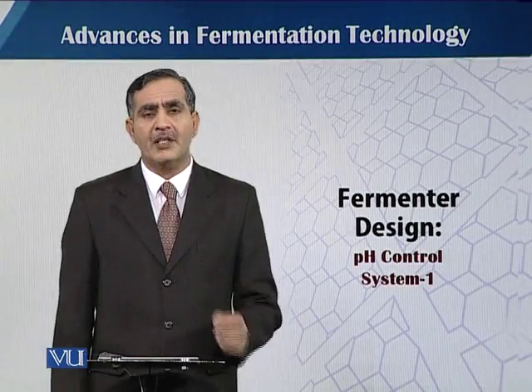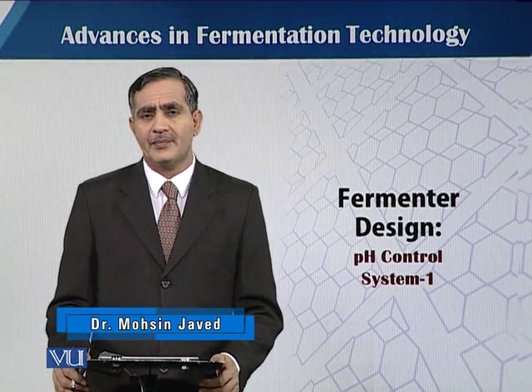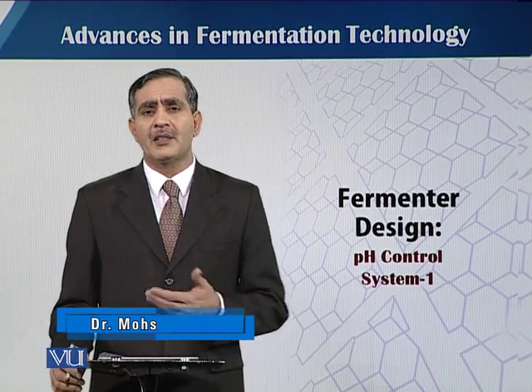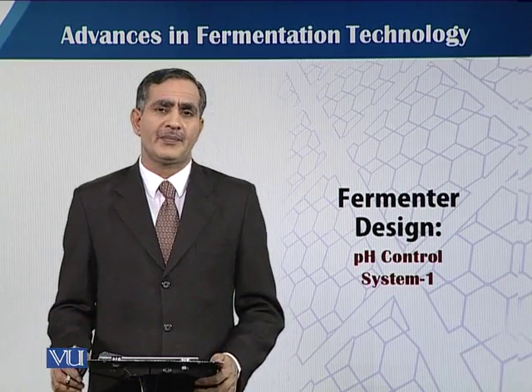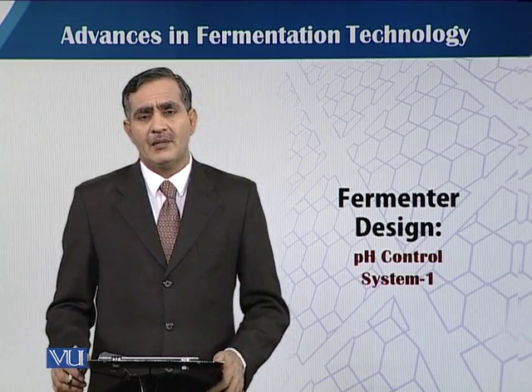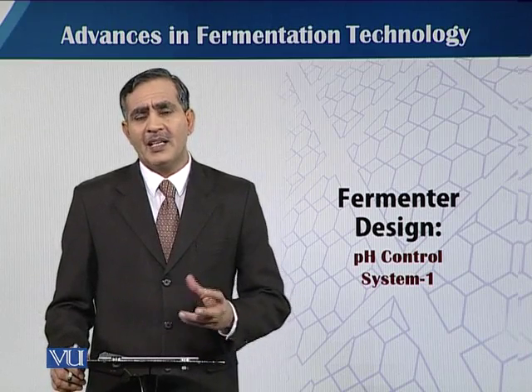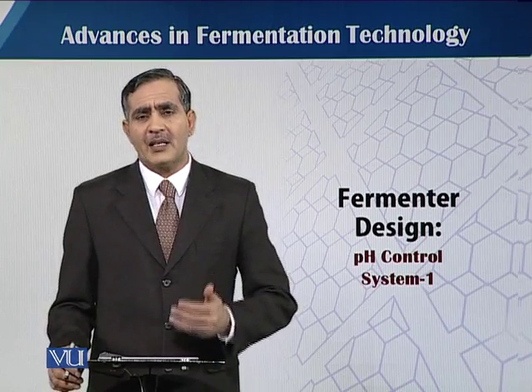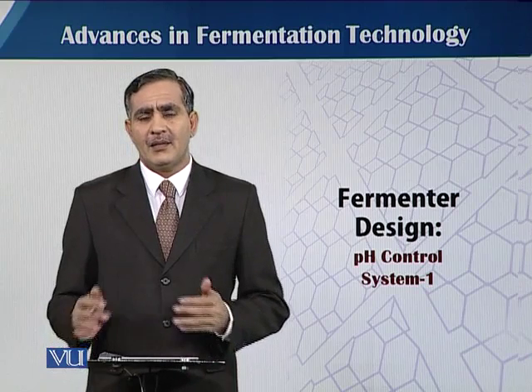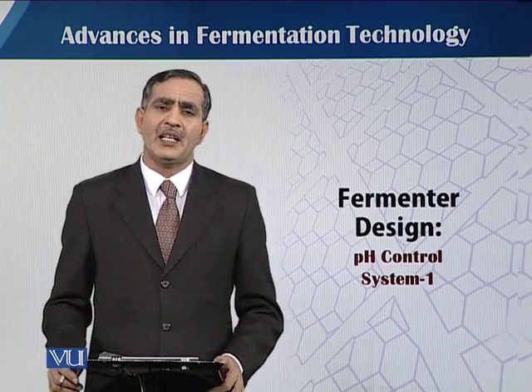In this module, we will talk about the pH control system while designing a fermenter. pH is very critical. All the biological systems require a specific pH. Minor changes in pH are controlled by the buffering capacity while designing the medium, because we add some buffer compounds which can check minor changes in the pH value.